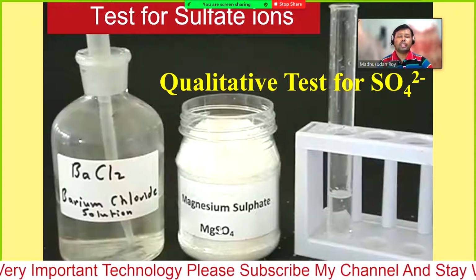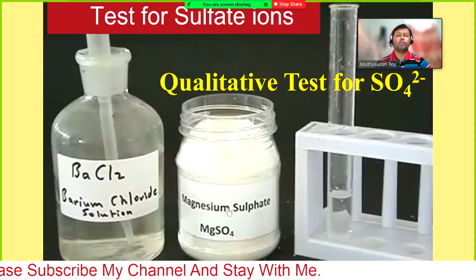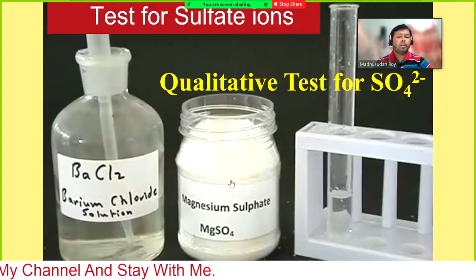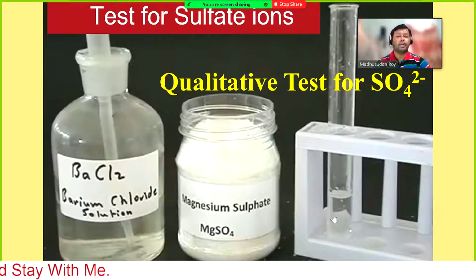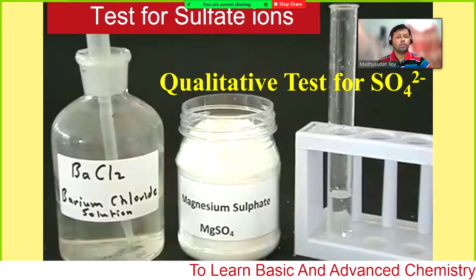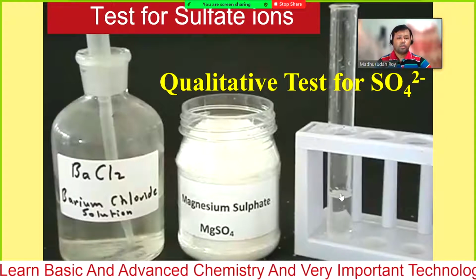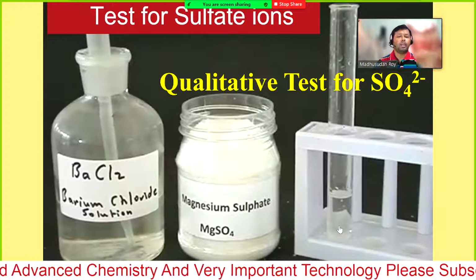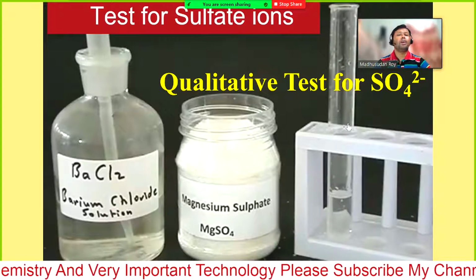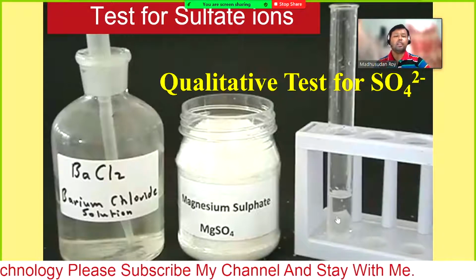It is almost clear, but I should shake a little bit more. I should also not take too much magnesium sulfate, just a little bit, because you don't need a huge amount here. We will observe a very clear white precipitation, so we don't need too much salt. We need just a small amount of salt so that we can dissolve it in water and get a clear, transparent solution, so that you are not confused about whether the precipitation is there or not.